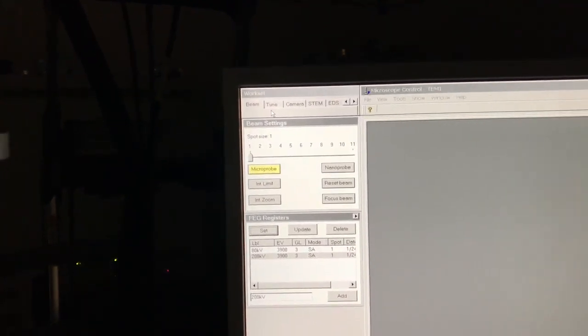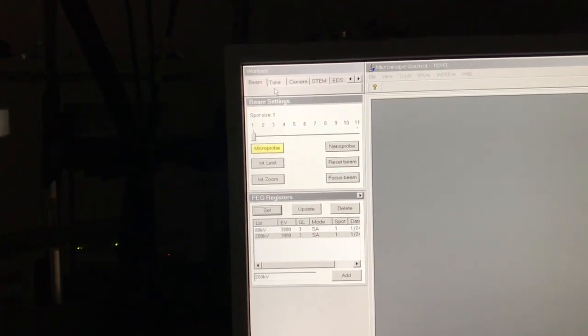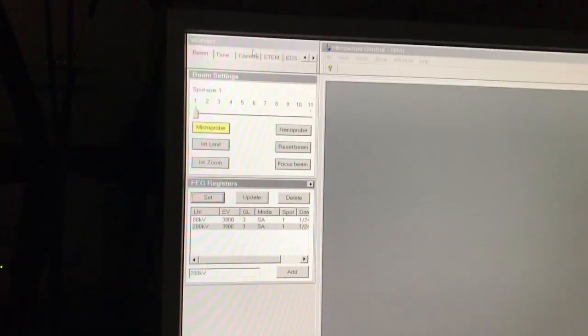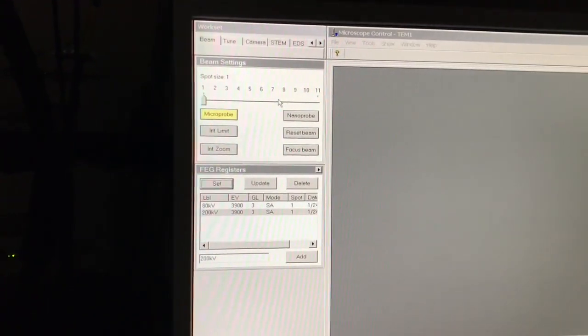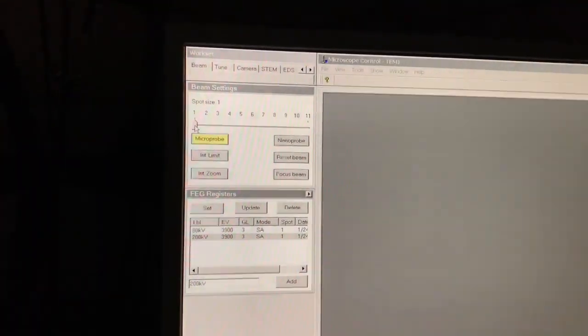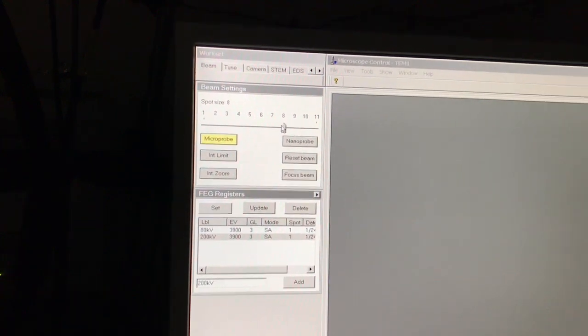This is something that you kind of have to play around with, and we'll go over how to test this to see if it's sufficient or not. But generally speaking, I'll go up to between maybe 7 or 8. So for today, we'll start with 8, and leave it there.